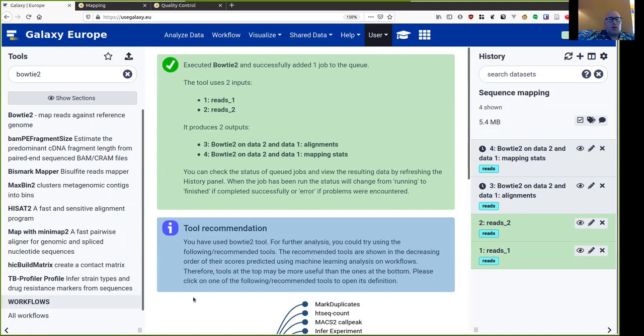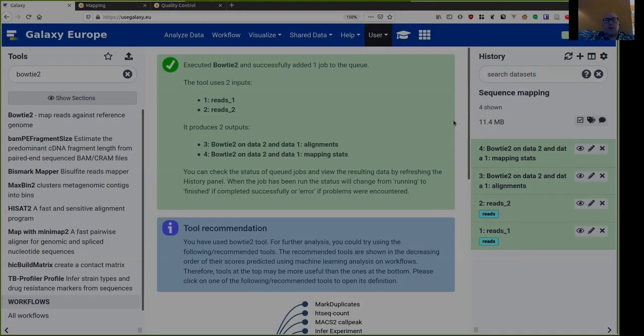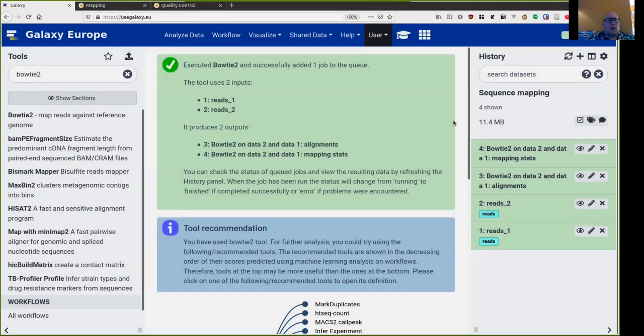Short read mapping is a somewhat time consuming process. In this tutorial, however, we are dealing with small data sets and mapping should proceed relatively fast. Our mapping has completed. Let us have a look at some statistics about how the mapping was done.